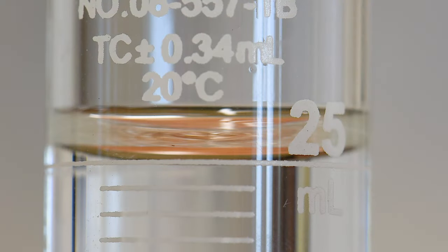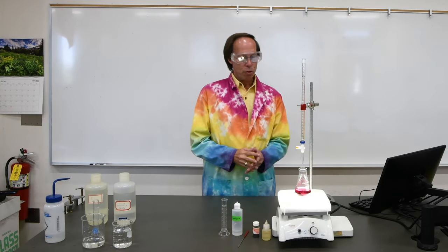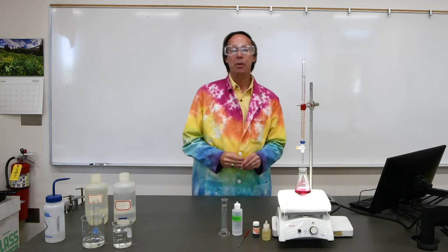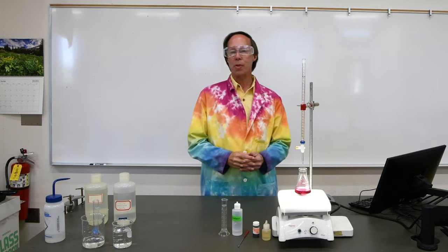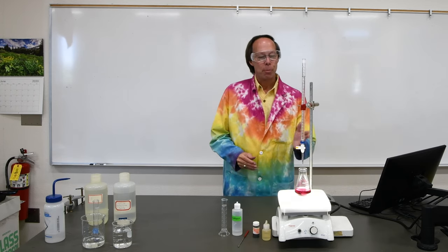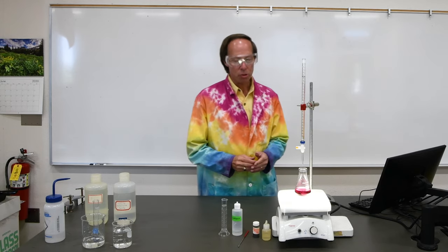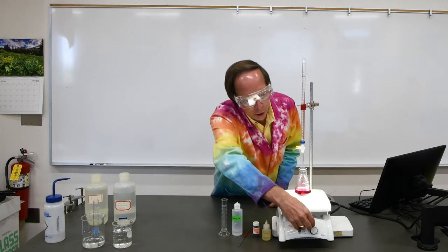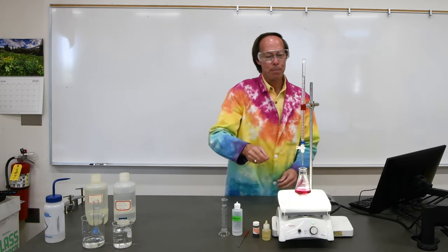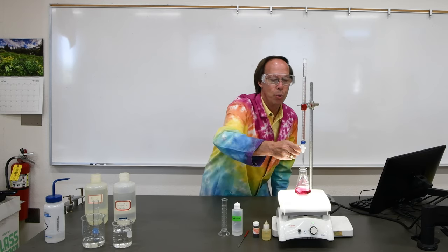This is the sample of our unknown calcium carbonate for our final trial. Let's do one more trial of the unknown, and then we can average those two. So that first rough trial we did of the unknown, we're not going to have to do any calculations for that one. That was just to give us an idea of where our endpoint would be. And from the first trial, it looks like it was just over 1.5 milliliters, so we should probably expect something similar this time. So let's go ahead and turn on the stirrer. And we'll add it slower.